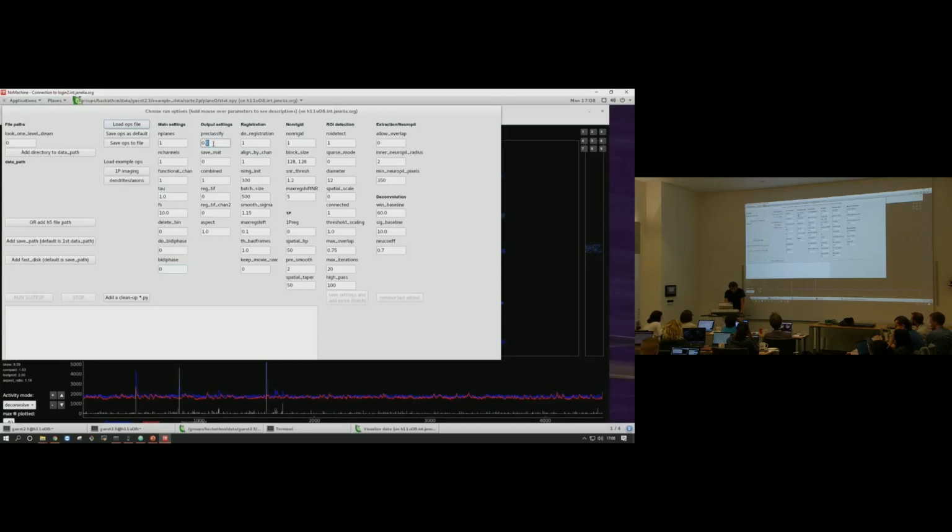On the output side, there's whether you want the algorithm to pre-classify the ROIs and throw away everything that's not classified as a soma, because you've reached the point where you're not even going to bother with those, you're just going to take the automated output of the algorithm. It's a probability, so set that to 0.5, for instance, or 0.3, or whatever. Don't set it to 0.1. Set it to 1, you won't get anything left. So that's the probability threshold on the classifier.